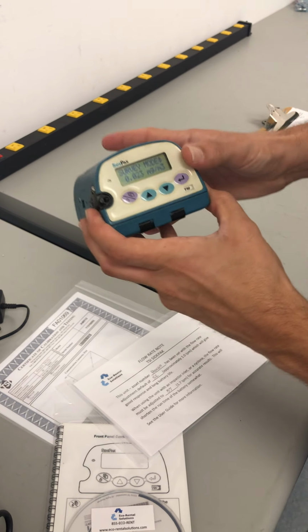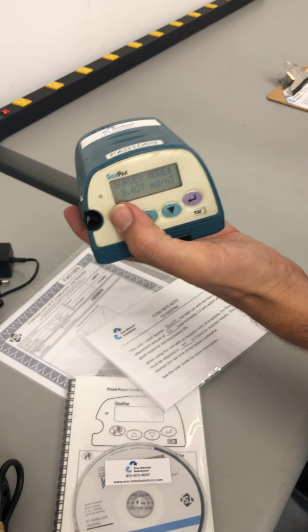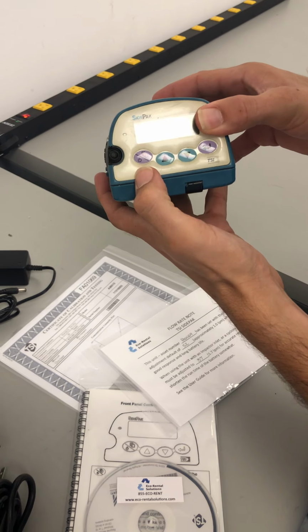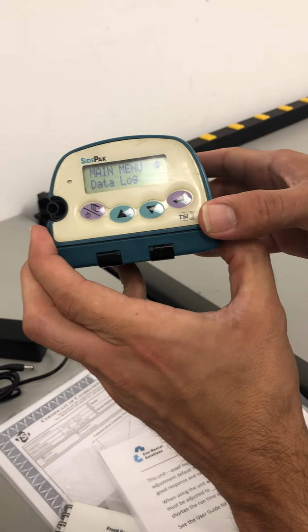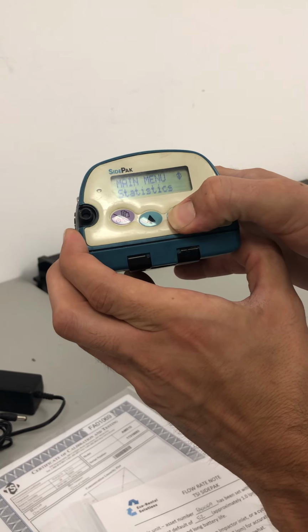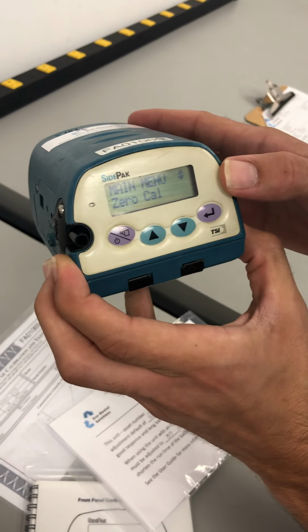All right. Now, say we've used it for a few days and it seems like the zero point has drifted and we're not getting the numbers we're really expecting. Got it. We can go into this. This will go to your menu, if you will. Just click the power button once, that's right. So now we're in the main menu. Then we can cycle through the different things they have: data logs, setup, statistics, and here we've gotten to zero cal. Oh, there you go. Got it.